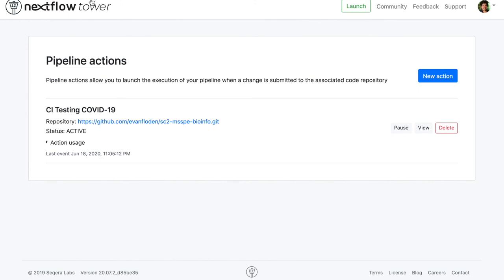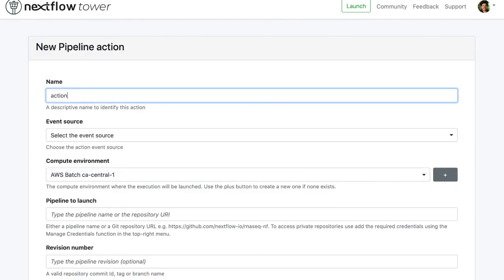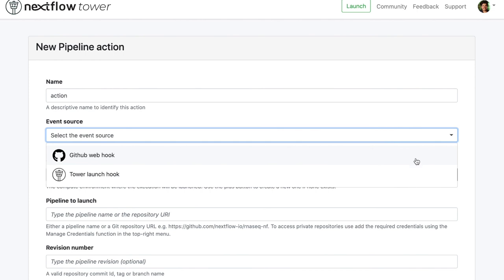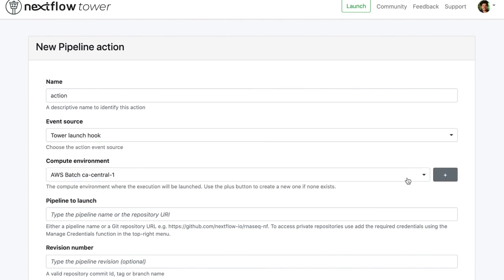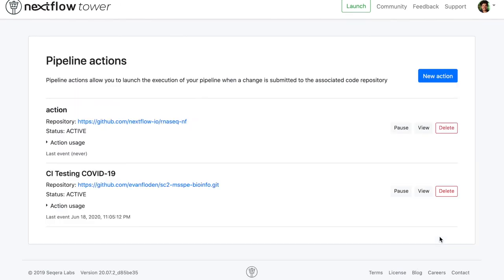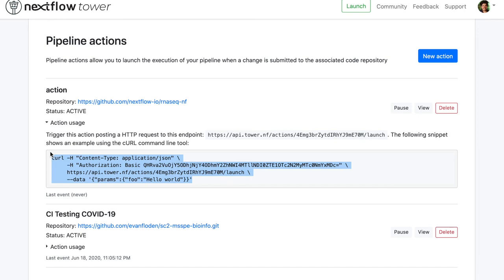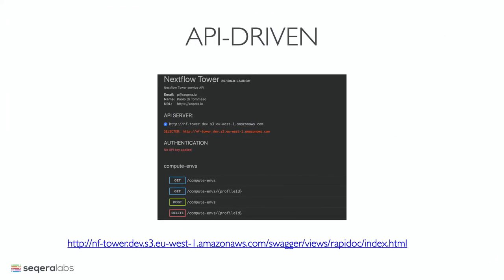One of the more recent features added is pipeline actions — these allow events to trigger the execution of a pipeline. These events could be a git commit or an API call via a webhook. In this example, creating a webhook connected to a compute environment means an API call would trigger the execution of that pipeline with those parameters. Anything you can do from the user interface can also be done via an API. The idea is that users of all experience levels — whether simply running a pipeline in a lab or connecting Nextflow pipelines to existing systems — can all be accomplished using Tower.